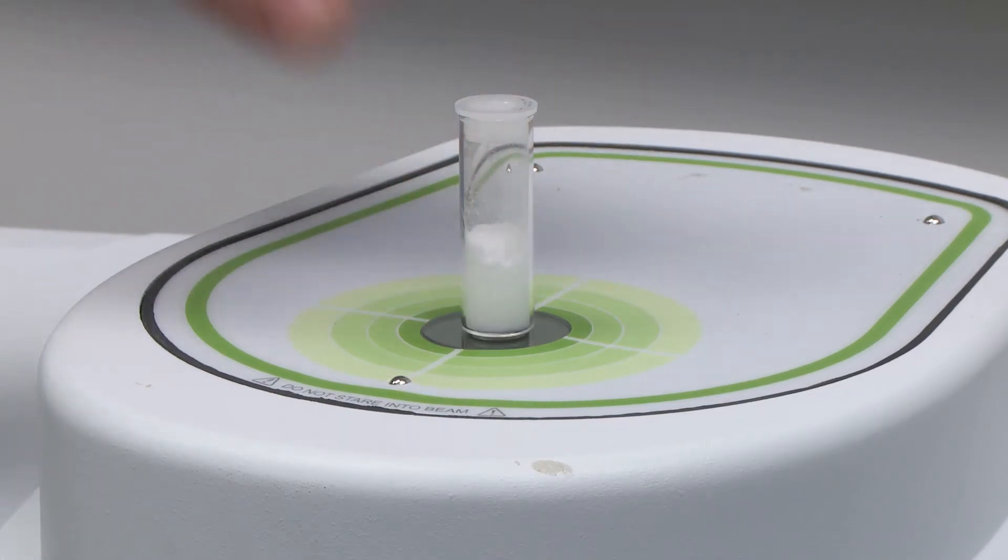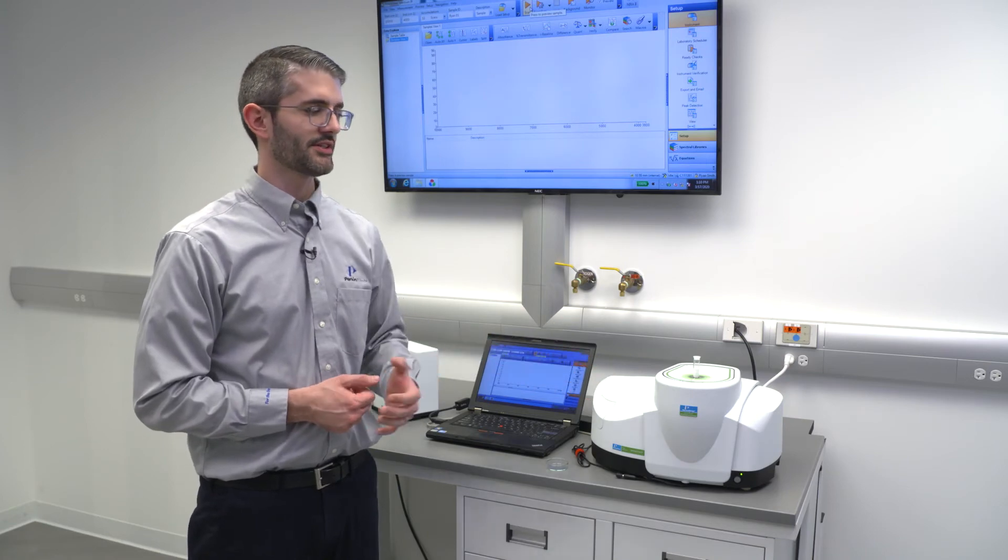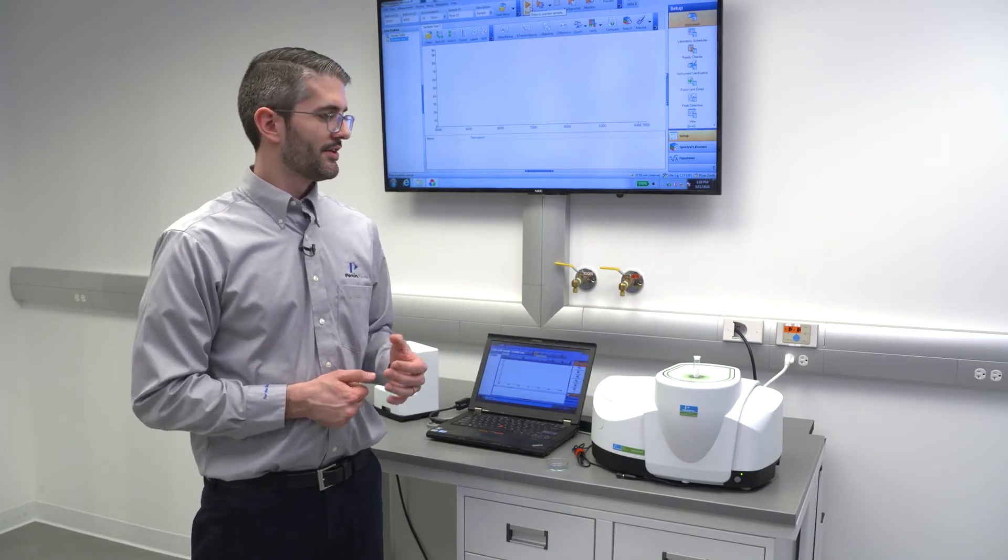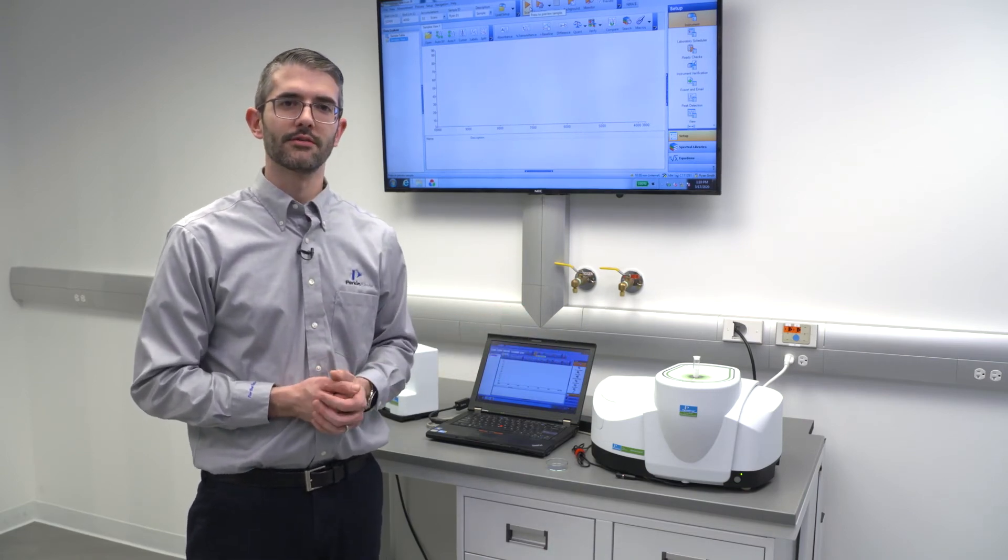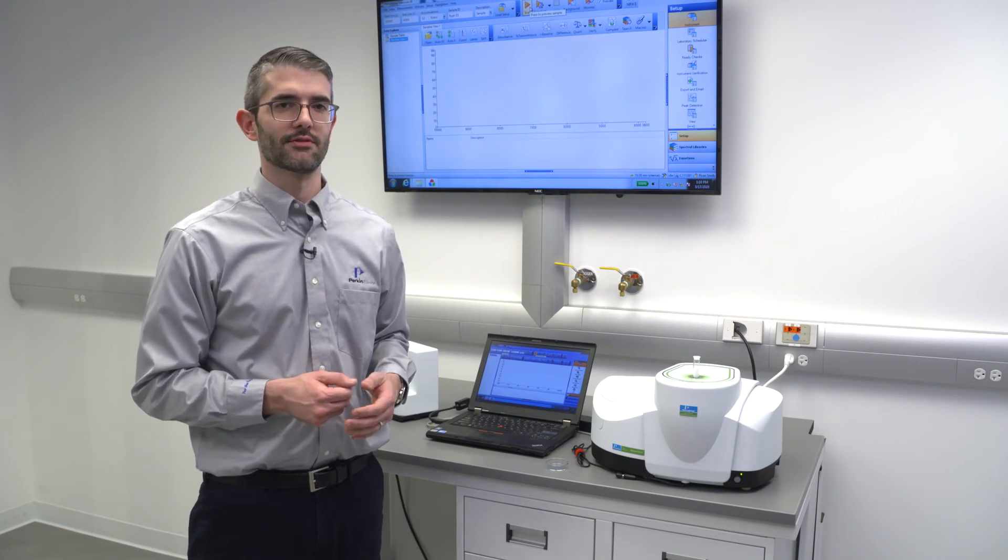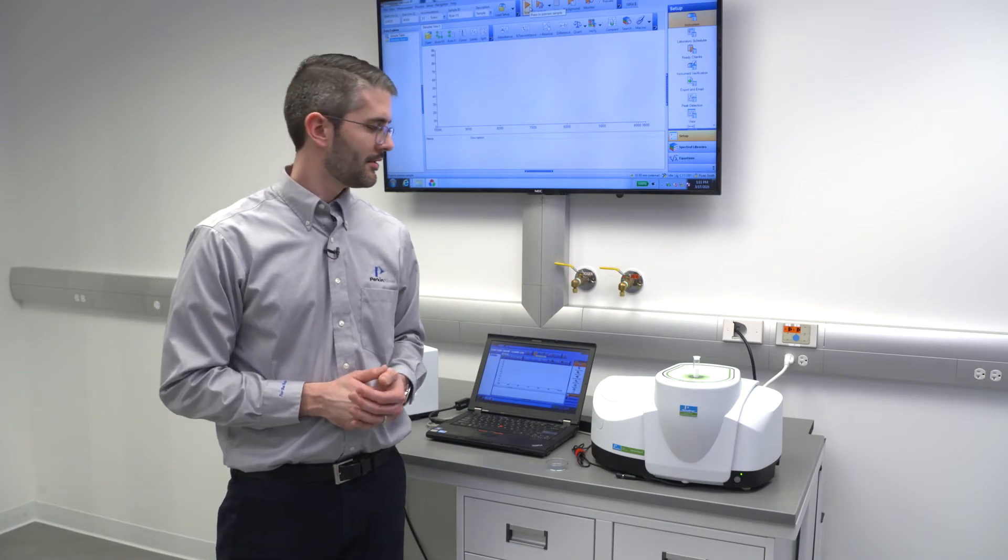For sample measurement, the sample can be placed on the optical port. As with other FT-IR measurements, the measurement occurs in two distinct steps: the first step being a background measurement, the second step being the sample measurement. When employing the NIRM diffuse reflectance accessory, this measurement occurs back-to-back automatically. The system performs the background measurement using an internal reference material, and then diverts the near-infrared beam towards the upper optical port on the accessory, allowing measurement of the sample. Let's try this out.